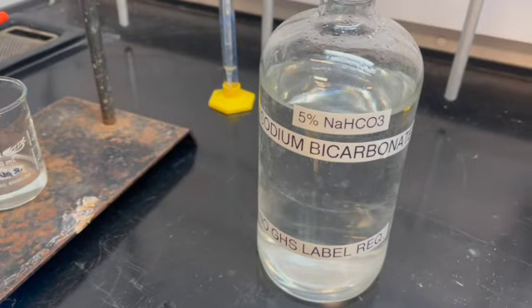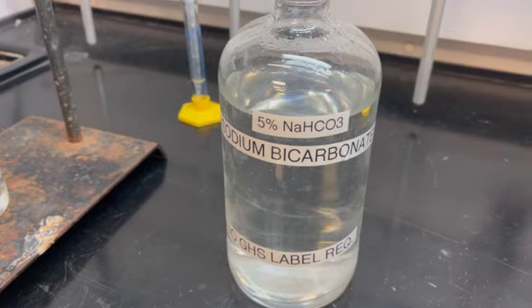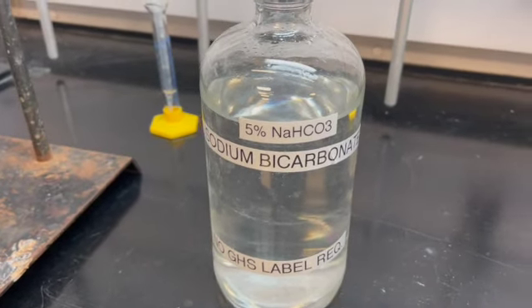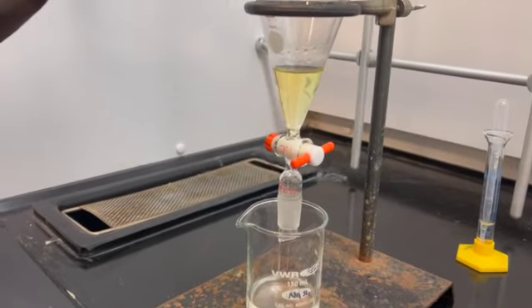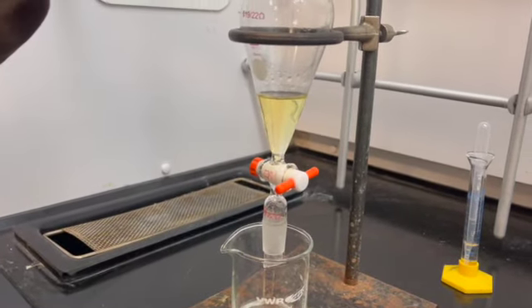We are going to add 15 milliliters of 5% sodium bicarbonate, also known as NaHCO3, into our separatory funnel, in which we will then shake and open, shake and open.